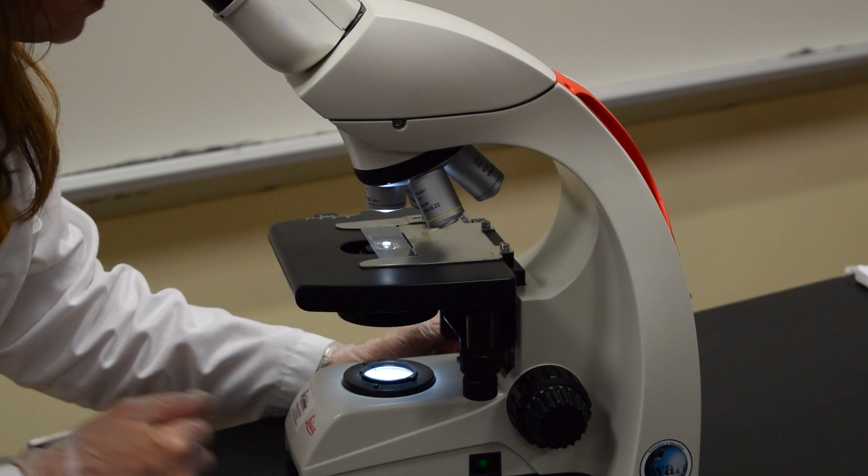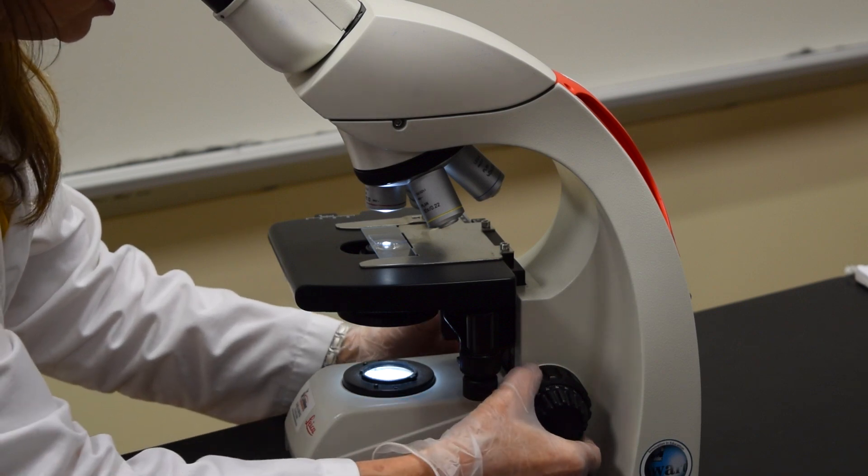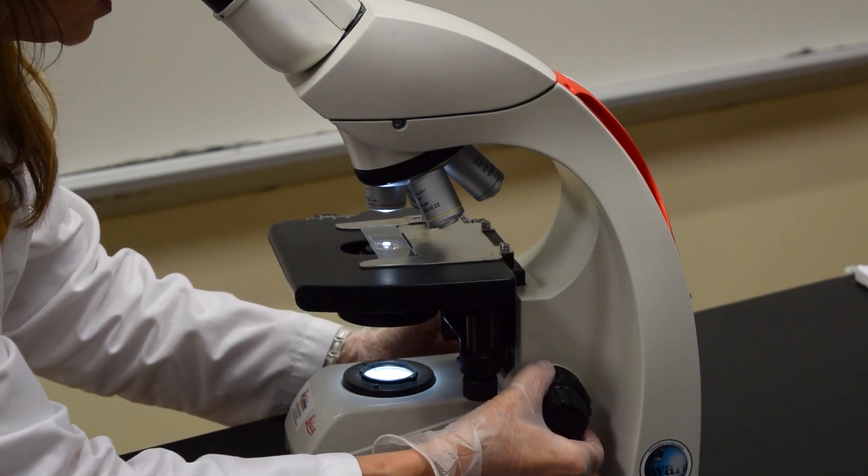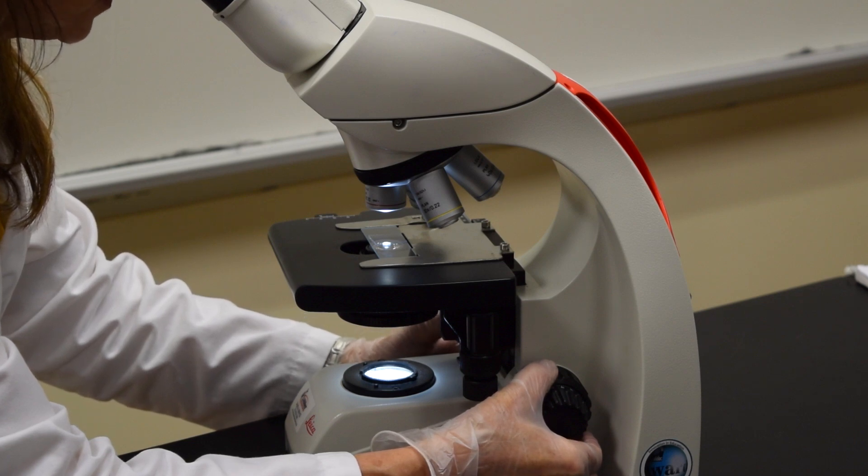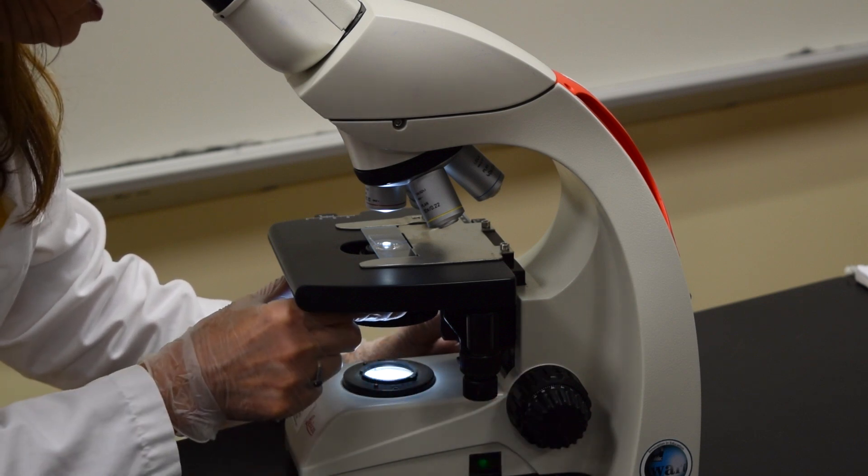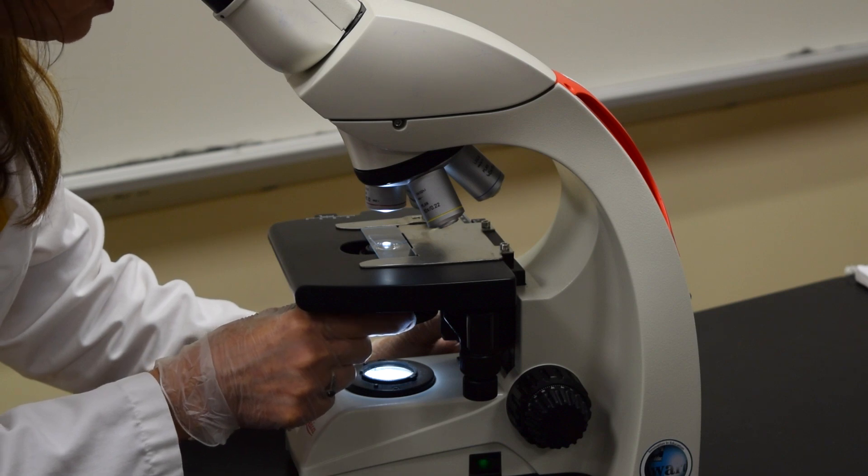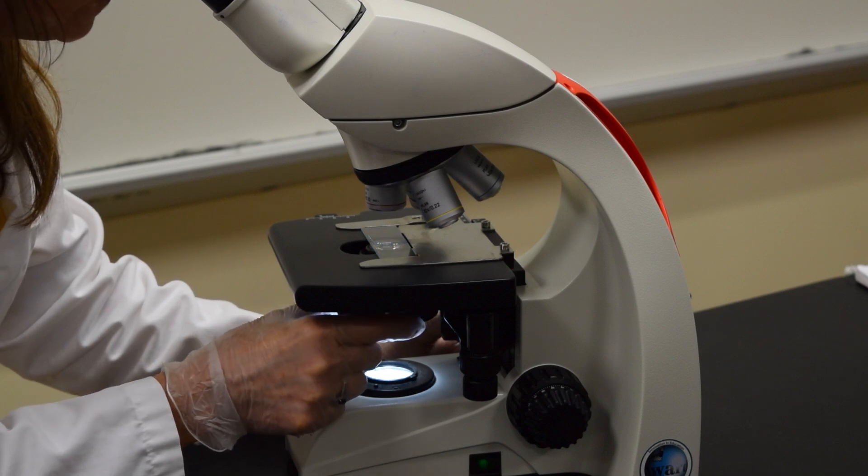Take a look under the microscope. Use the coarse adjustment knob to get the edge of the cover slip in focus. You should dim the light. To dim the light going through the object, you're going to use the diaphragm.